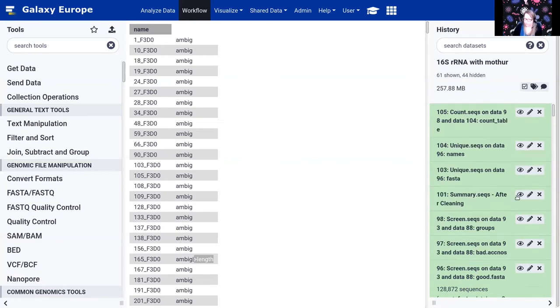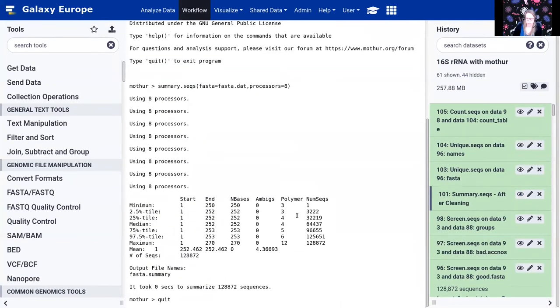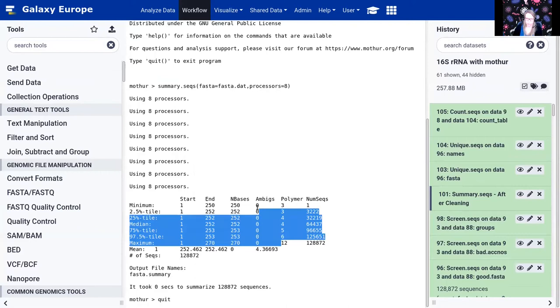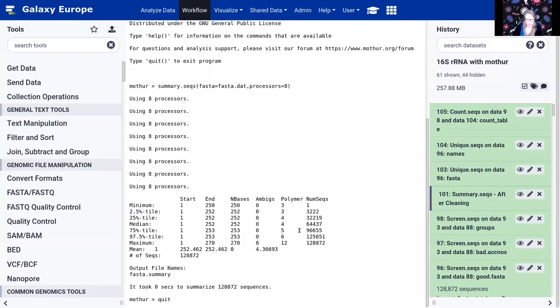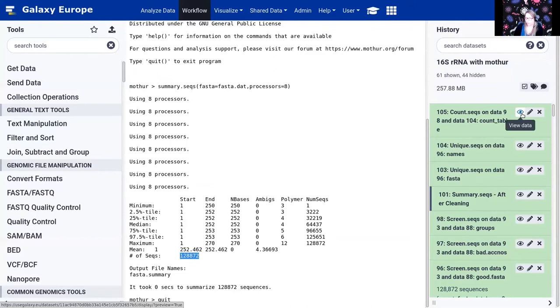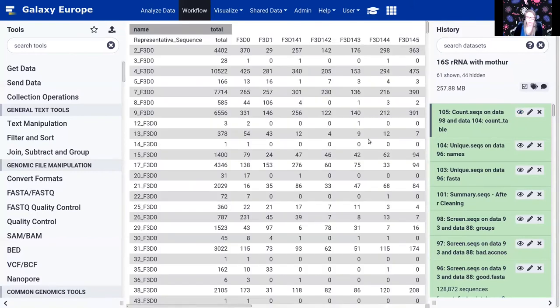Looking at the summary after cleaning: our maximum length is now 270 bp, exactly the limit we set. All data has zero ambiguous bases. The total is 128,872 sequences. The count table from count.seqs shows for each unique sequence how many times it occurs in each sample — for example, this read represents 4,402 total sequences — and we will provide this count table together with the FASTA file for downstream analysis.